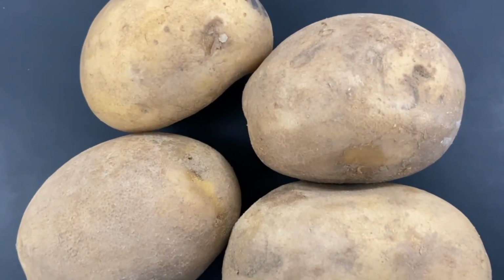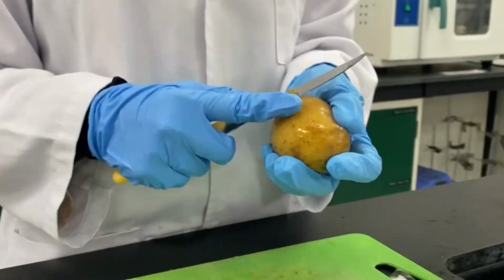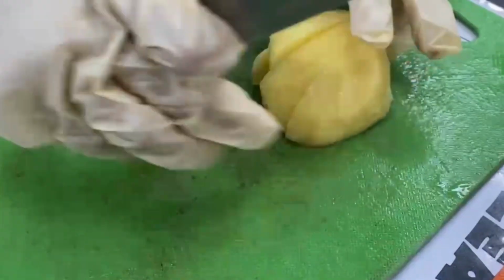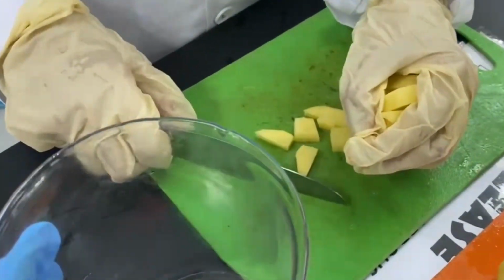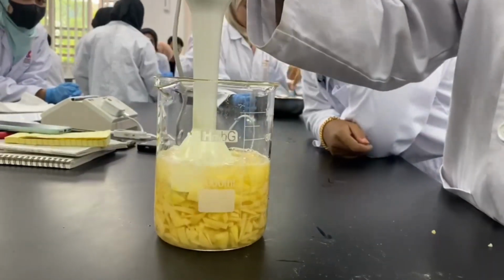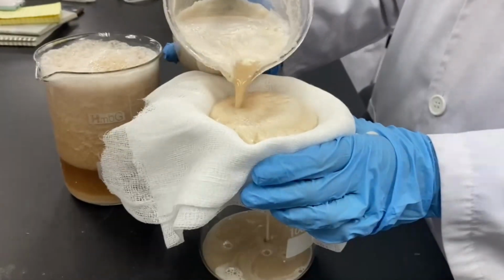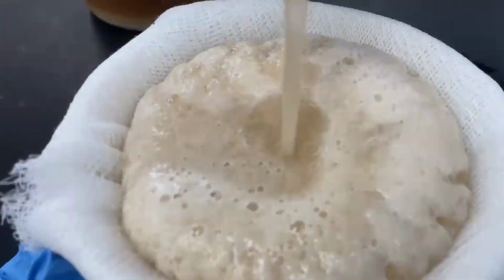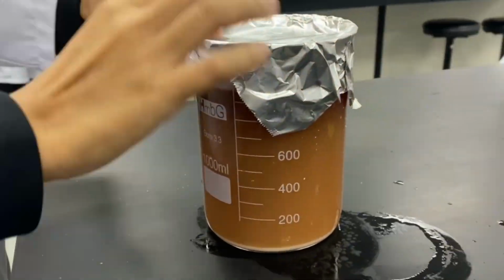First of all, the potatoes are cleaned. Then, peel them and dice them into small cubes using a knife. After that, place the potato into a beaker, add some water, and then blend it until it becomes even. Next, filter the mixture over a beaker with gauze cloth. Cover it with aluminium foil and leave it for 3 days.